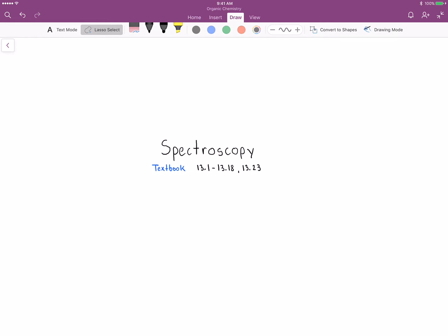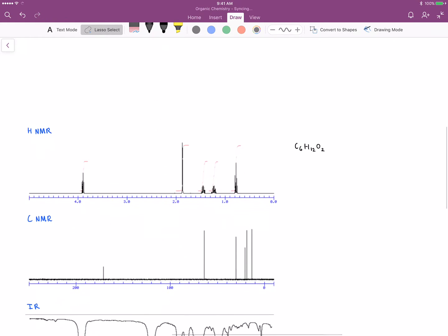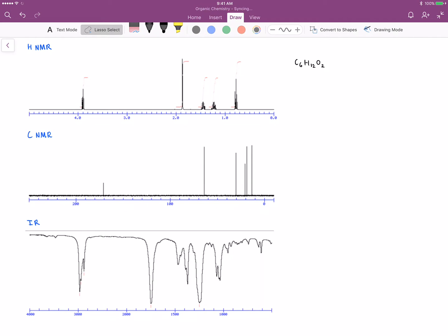Hey everyone, this is Joshua Sturgill. In this video we're going to be discussing spectroscopy and working through an example problem, discussing a compound and the specific properties of that compound. Below I've provided the HNMR, the CNMR, and the IR for a particular compound. The molecular formula for this compound is six carbons, 12 hydrogens, and two oxygens. I would encourage you to pause the video at this point and see if you can work through the data using the molecular formula.